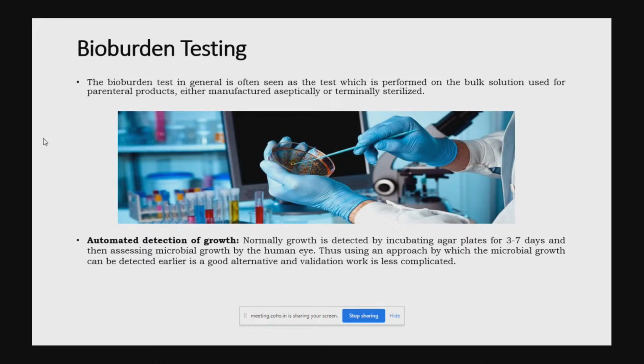In the bioburden test, what we can do, we are taking the solutions by using the same membrane filtration technique. We pre-wet the membrane, followed by we filter out the products. After that, we rinse the membrane using 0.1% peptone solution or desired diluents. After that, we take the membranes, transfer them onto the desired media and incubate.